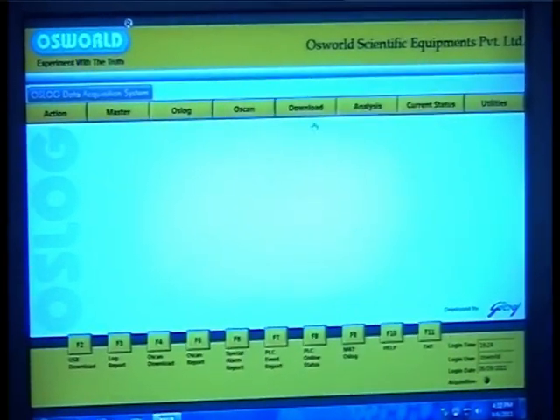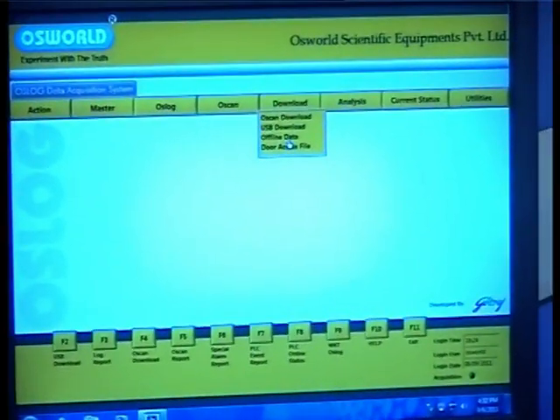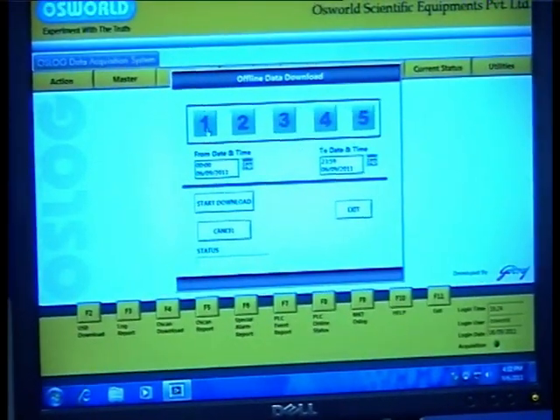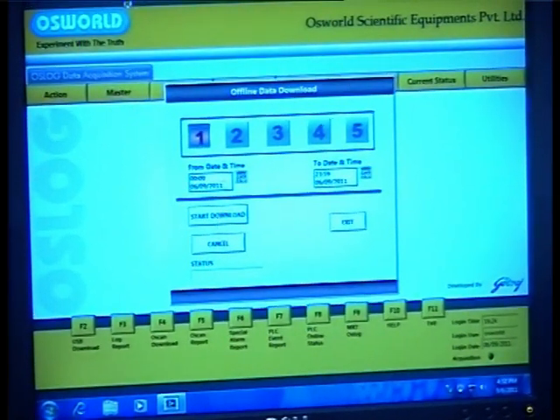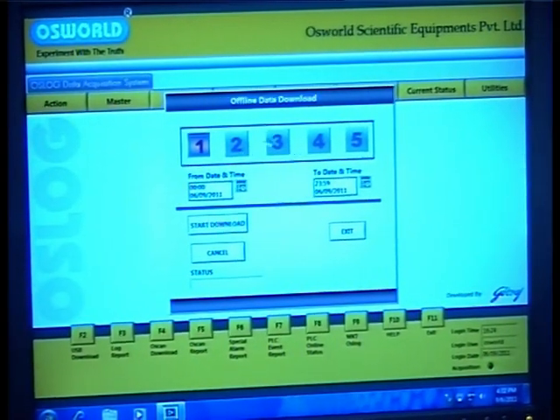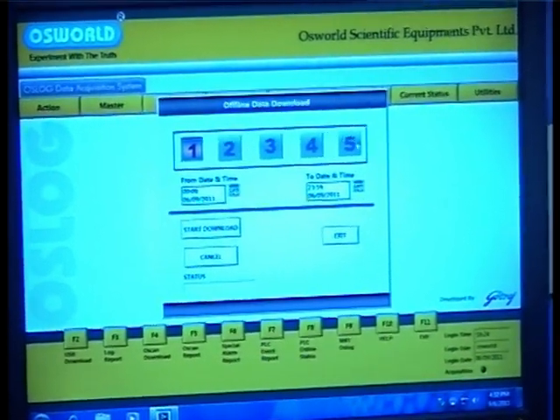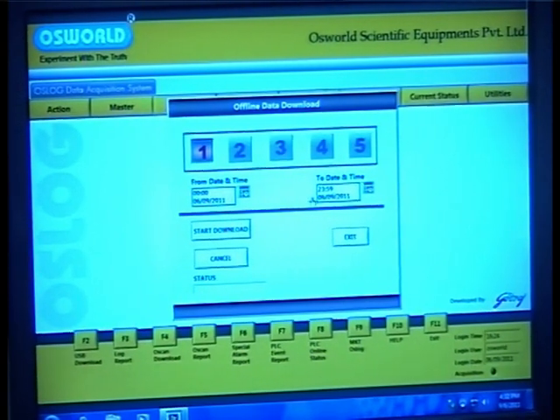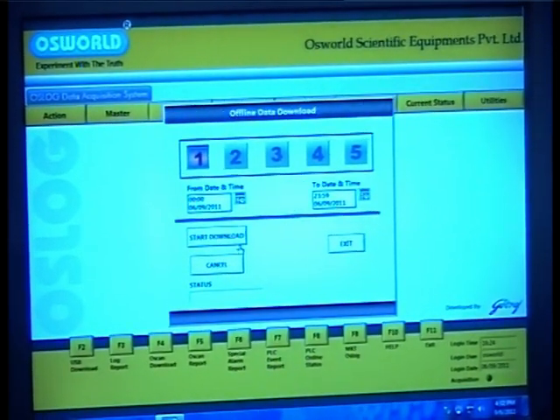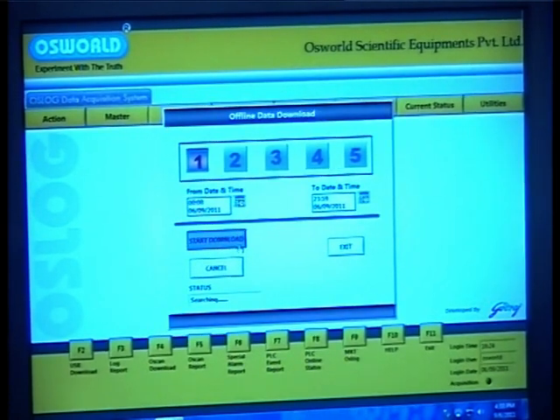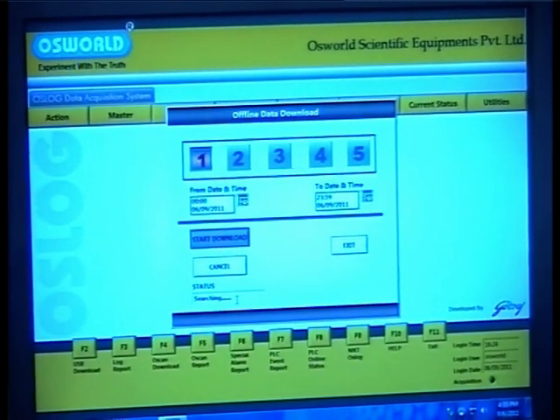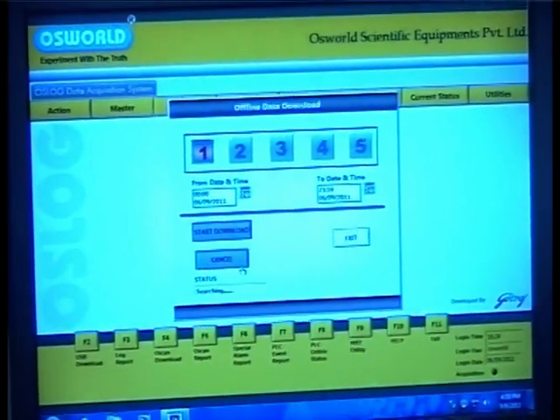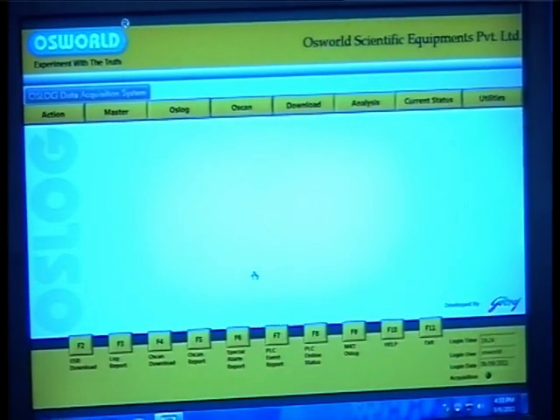The offline download option enables you to download data directly even in offline mode. Go to the download drop-down and select the offline data download option. A window opens up where you can see the option of 5 DSDs to be connected. Select the first option, enter the start date and time and the end date and time during which you require your data, and hit the start download button. In the status bar you will observe the progress of the data download until your download is complete.